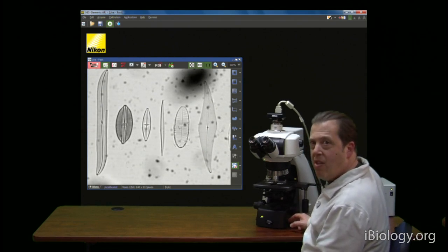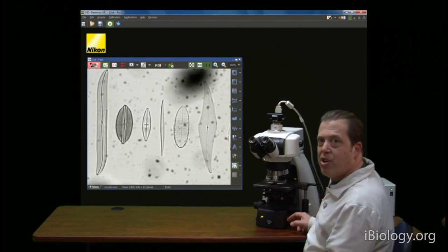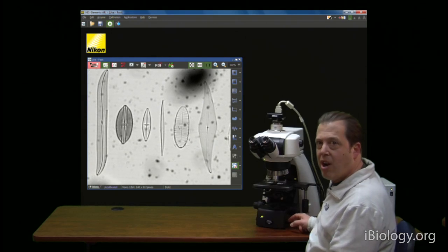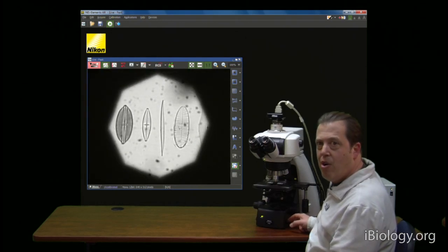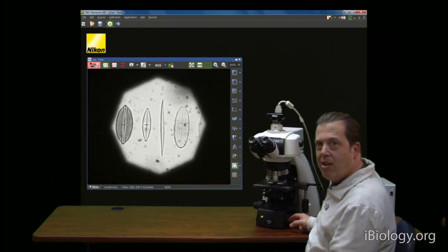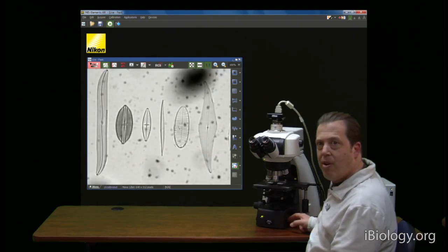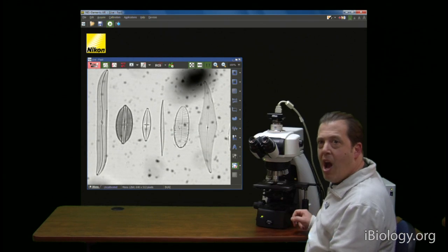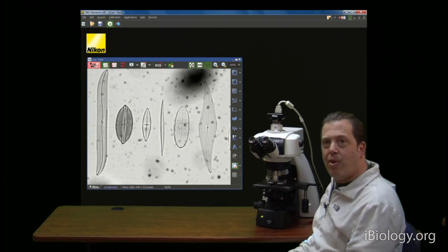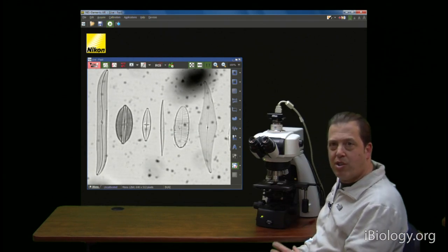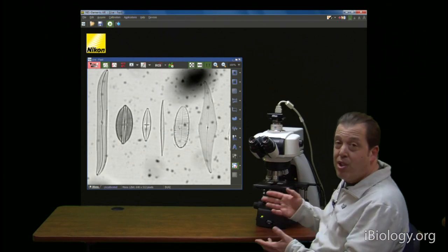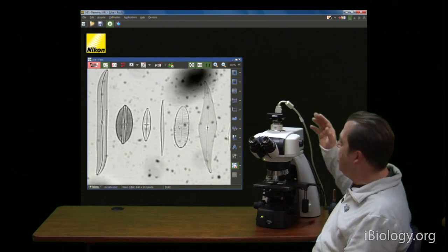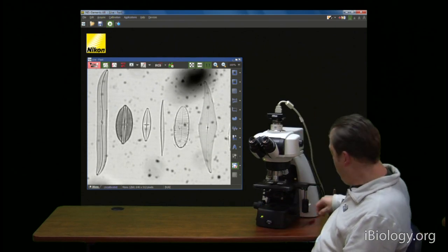And the second thing we'll do is check whether that dirt is on our camera or on our specimen, because those are the two image planes that were really greatly affected.